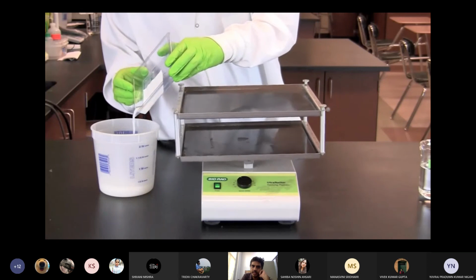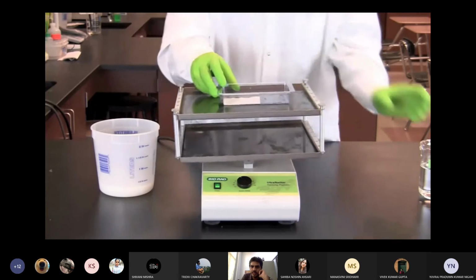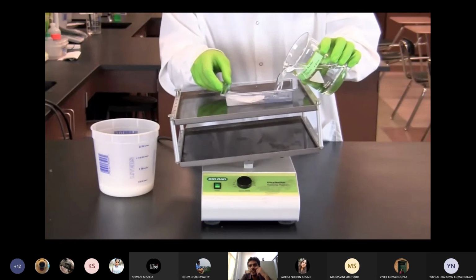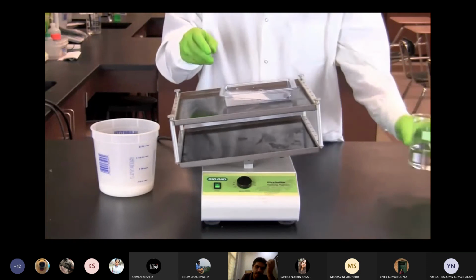So here also you need to wash. The washing step is necessary. Rinse the membrane quickly in 50 milliliters of wash buffer, and discard the wash buffer. After the addition of both antibodies, you need to go for the washing.